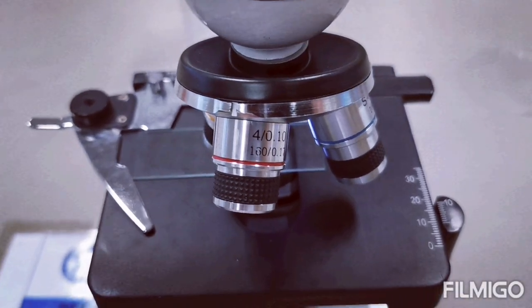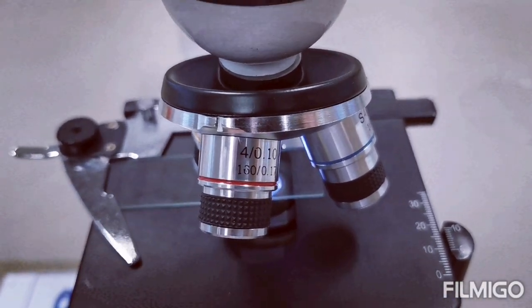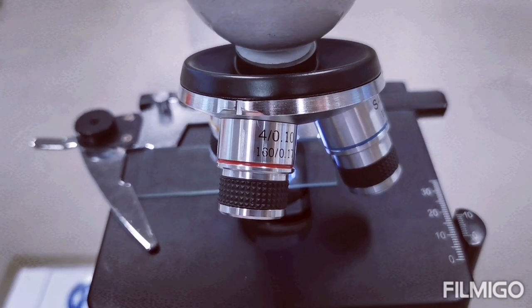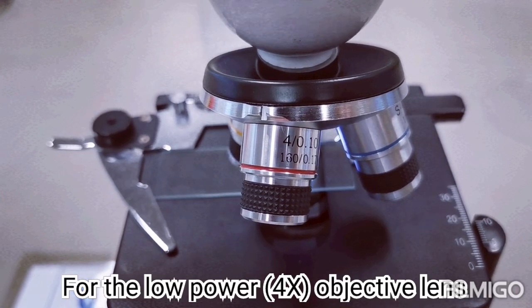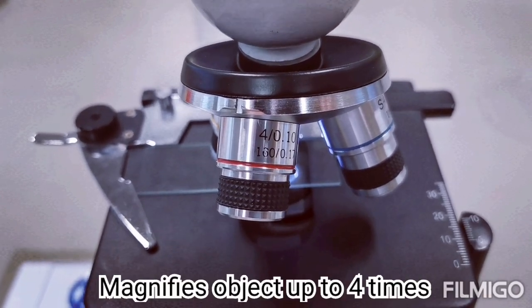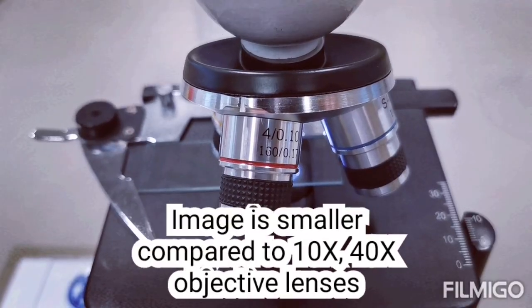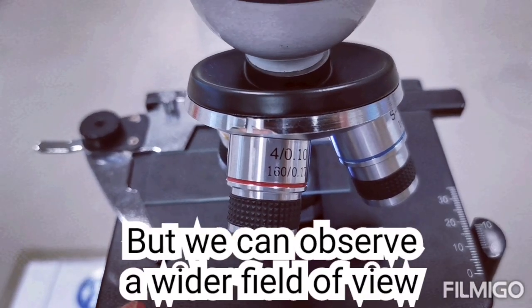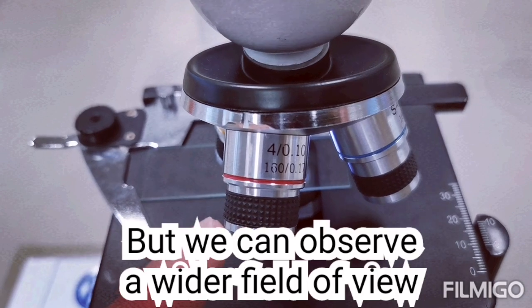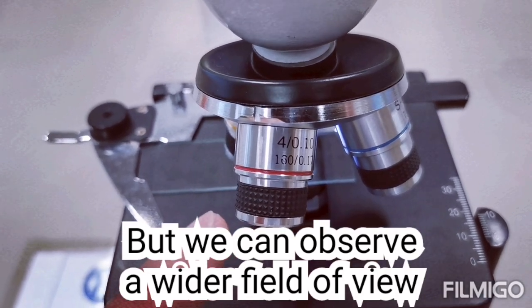Now, let us recap on the properties of the image under the different types of objective lenses. For the low power objective lens, or the 4 times objective lens, it magnifies the object up to 4 times, so the image is smaller or less magnified, but it allows us to observe a larger or wider field of view of the object, meaning that the image is more zoomed out.